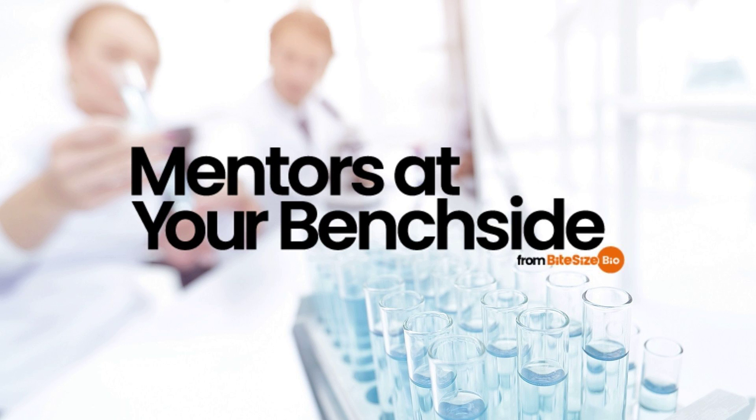Number 2, the Bradford assay. There are good reasons that the paper first describing the Bradford assay has been cited thousands of times. The Bradford assay is an elegantly simple colorimetric assay for protein quantification. It's based on the interaction between Coomassie Brilliant Blue, that's the stuff in your SDS-PAGE gels, and the arginine and aromatic residues within your protein. When the dye binds to these residues, its maximum absorbance shifts from 470 to 595 nanometers.